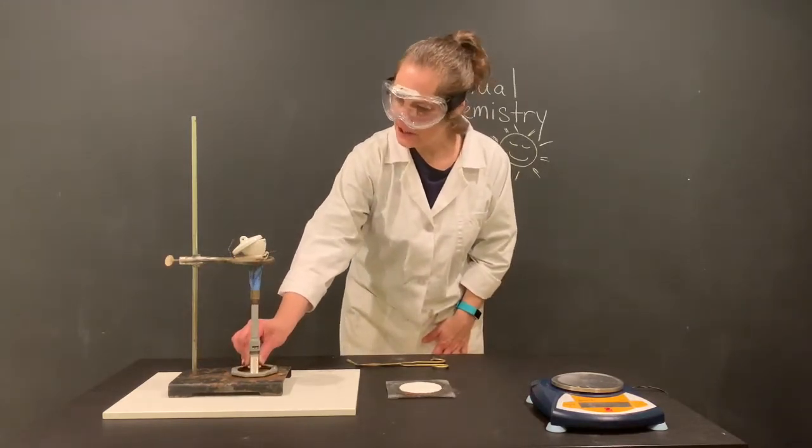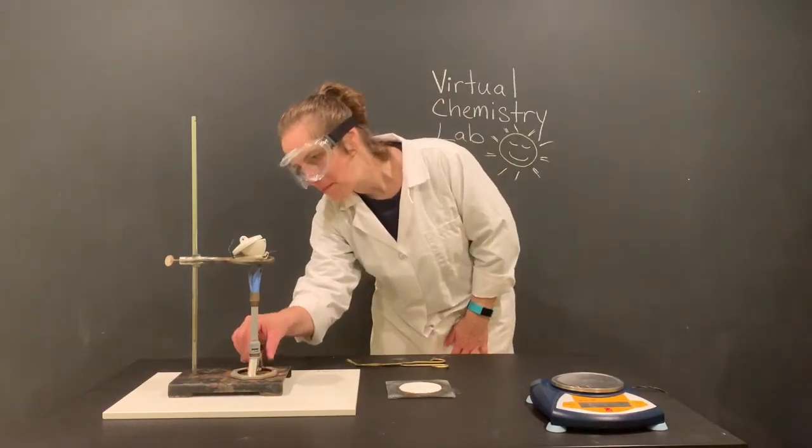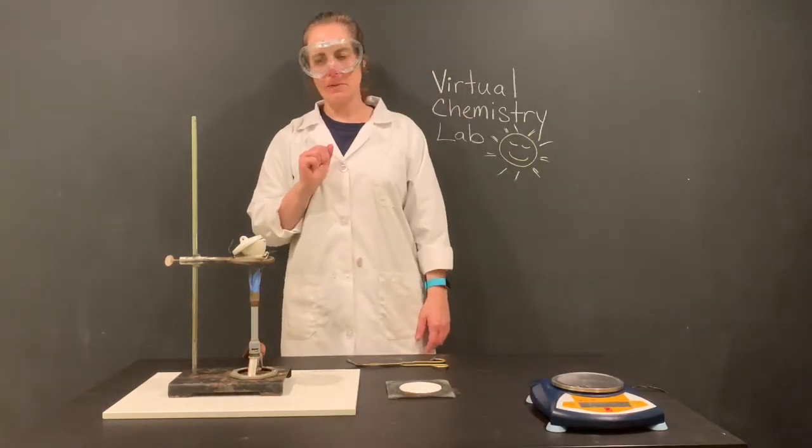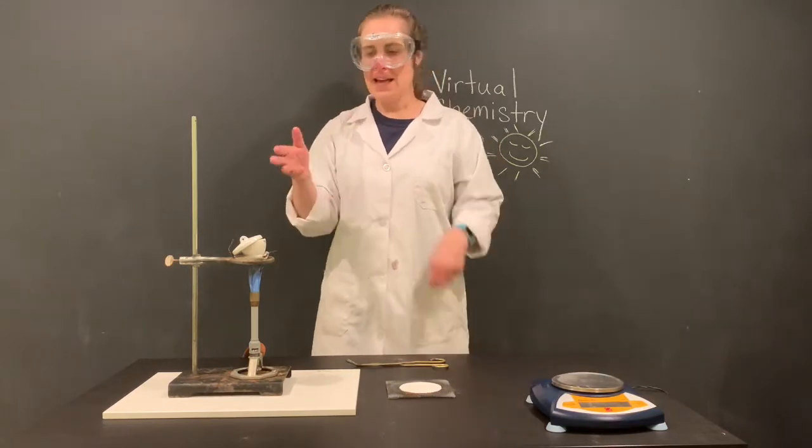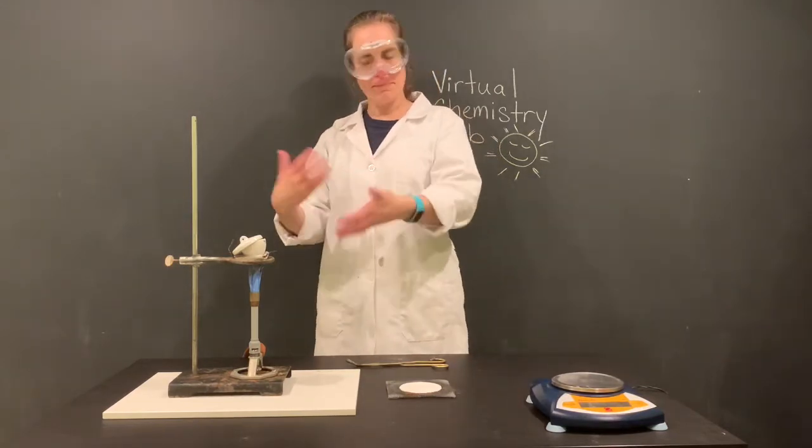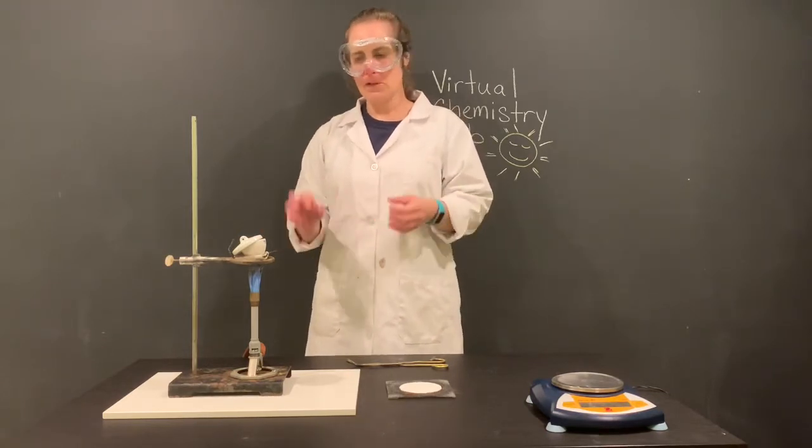So I'm going to carefully slide it under here, and it should be just kissing the bottom of my crucible there. Now you know crucibles, they get hot. They get hot fast, so even though this has been over the flame only for a very short time, it's already getting quite warm.